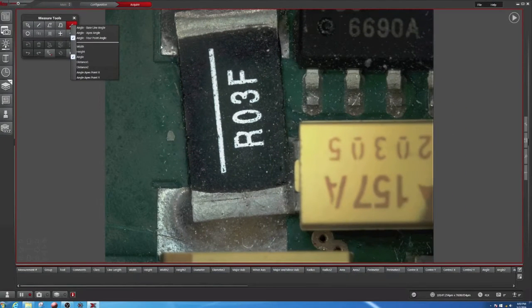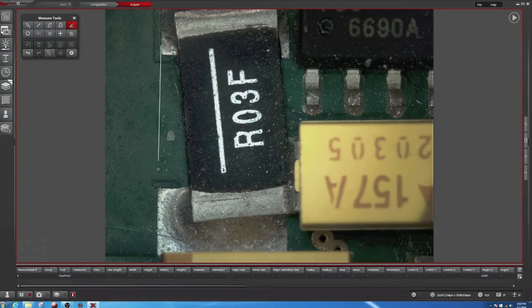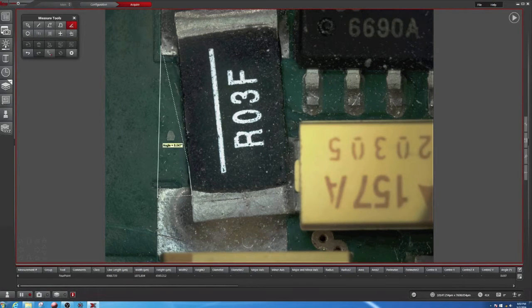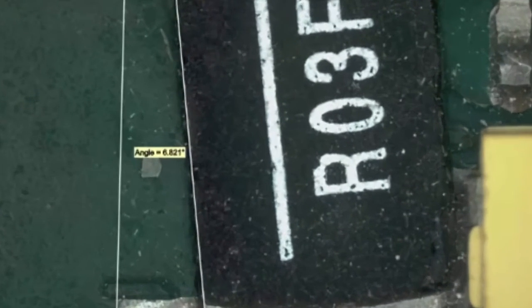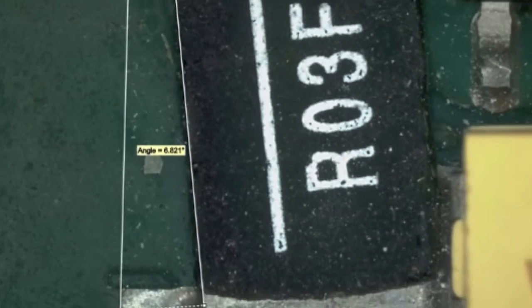The four-point angle has the advantage that I don't necessarily have to know where the two lines of the angle meet. So I can simply make an angle like this and find out that it's nearly seven degrees off.